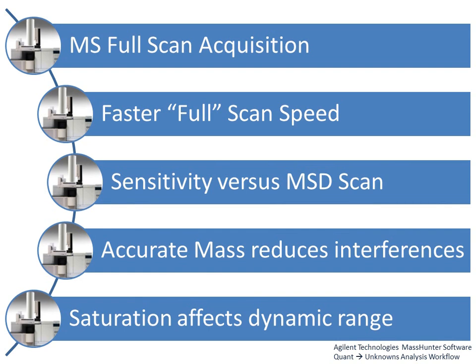And it's easy to understand because that would end up giving you more points across the peak, which would lead to better integration. And in unknowns, when you're trying to do deconvolution and separate peaks by retention time into these model peak shapes, the finer granularity of more points in retention time space would give you better resolution. So that benefits both quant and unknowns analysis.